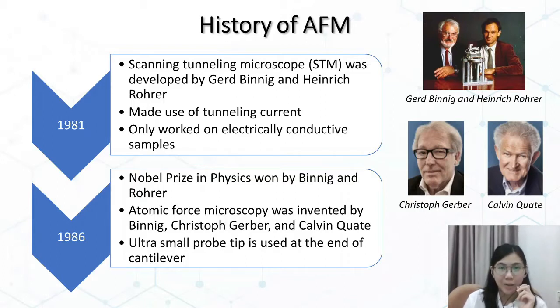This AFM can be used with non-conductive surfaces and can also be used like the STM to position objects as small as an atom. By using an ultra-small probe tip at the end of a cantilever, the AFM could attain very high resolutions.